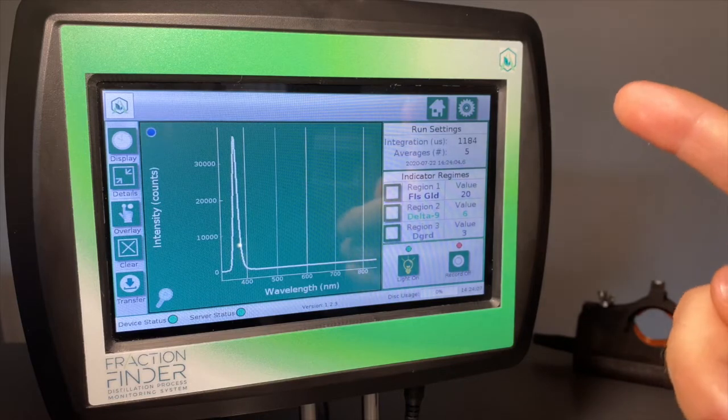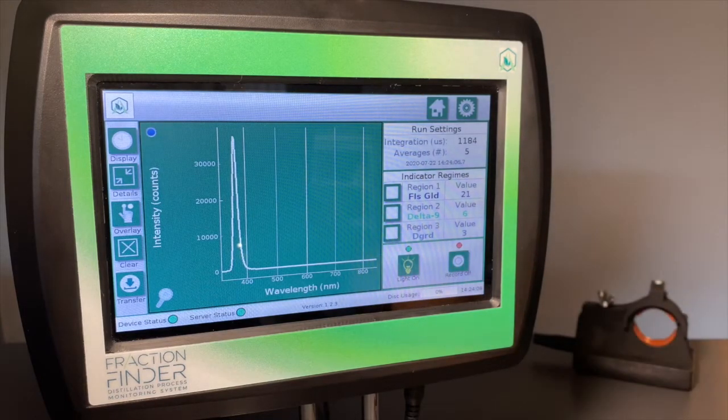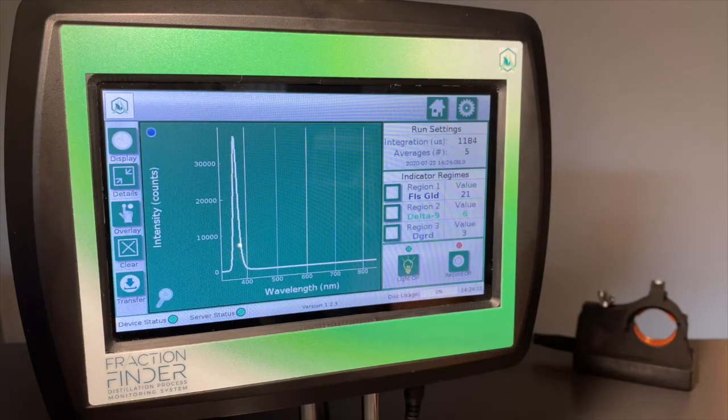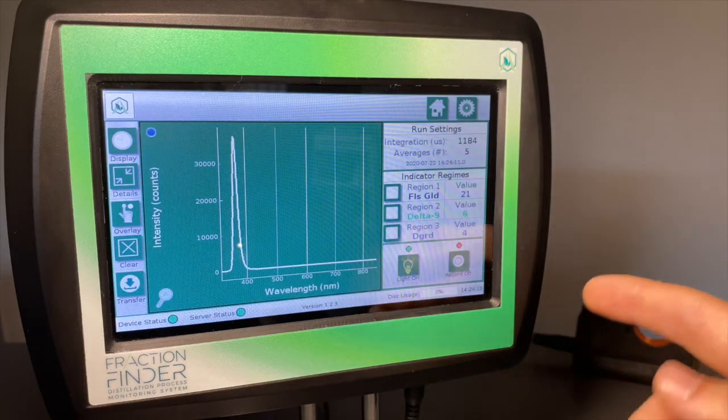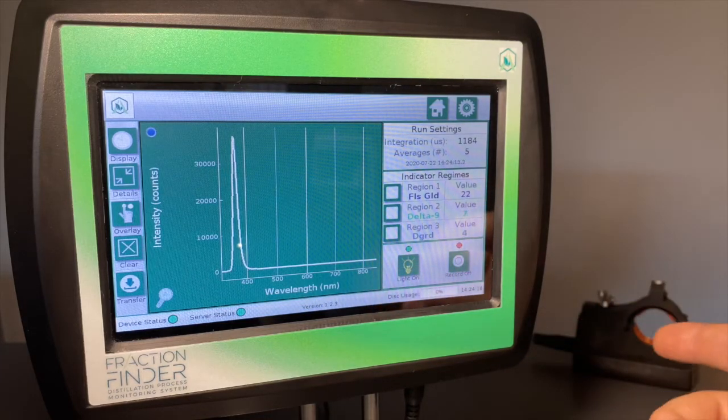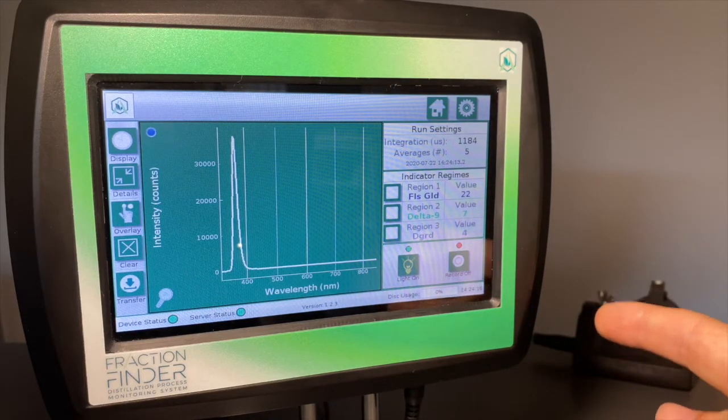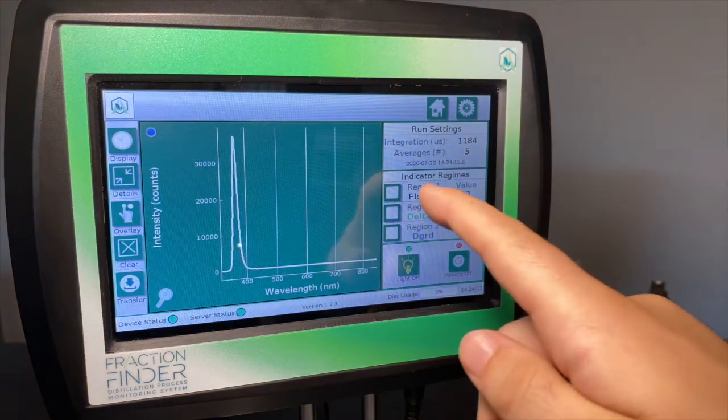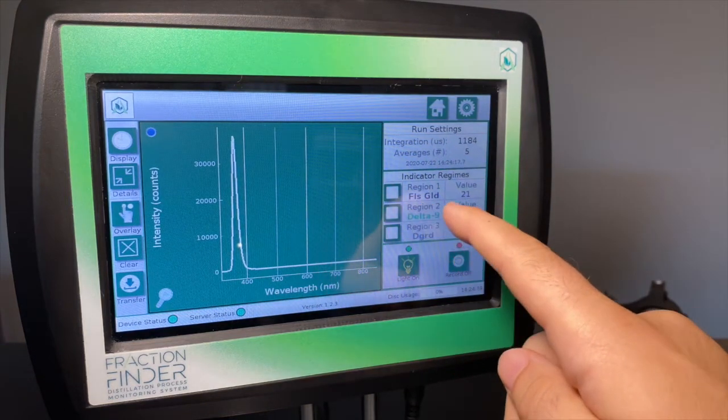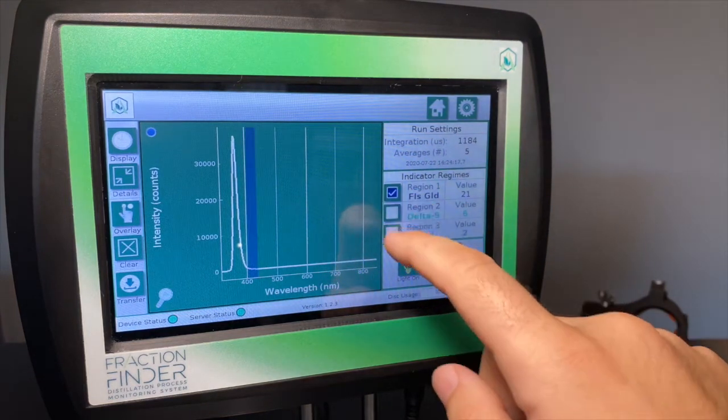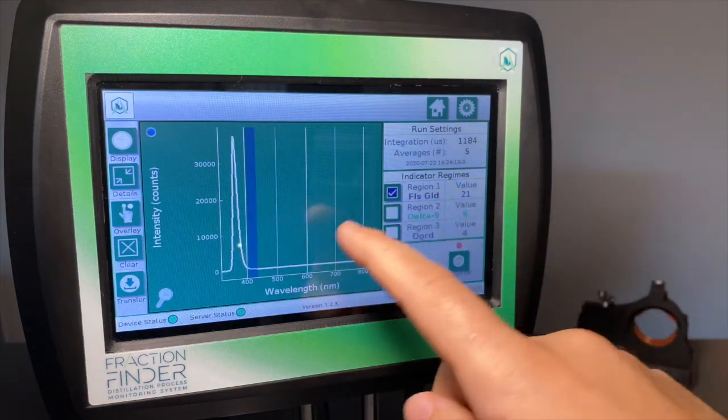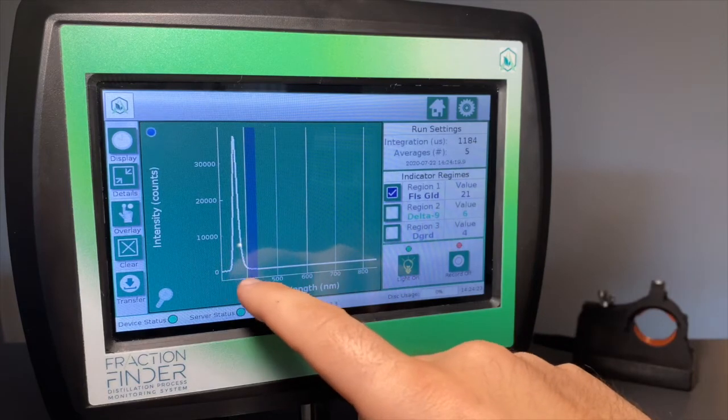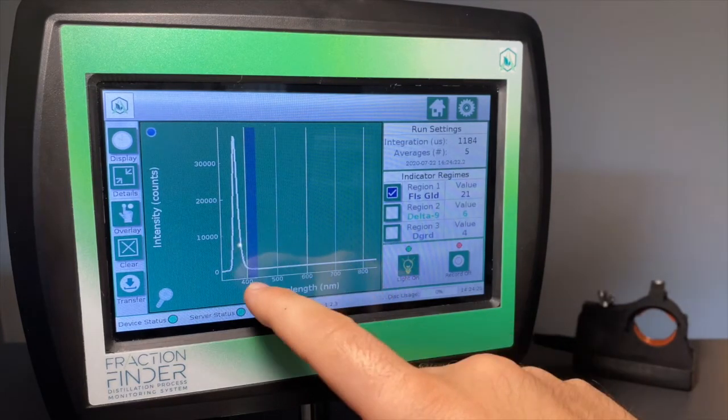So how I would recommend to someone that was running a short path distillation and distilling Delta 9 would be to set your region 1 as Fools Gold and that will essentially track the end of your heads fraction.